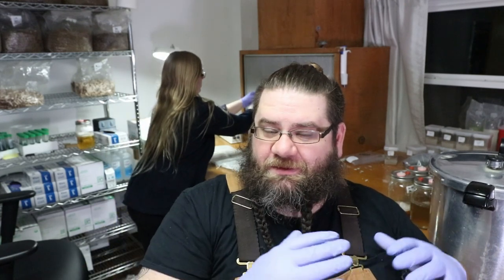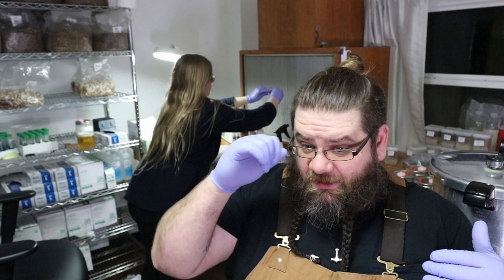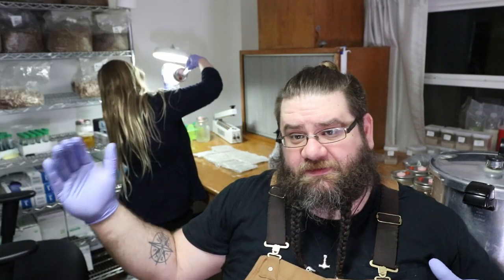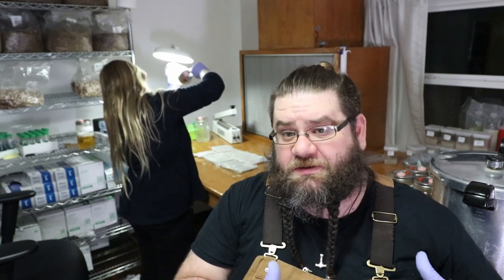That's really the big 3 differences. I mean, those are the big 3 sterilization methods open to most people at a smaller sized farm to moderate sized farm. Even with that big autoclave, unless I had a few of those units, you're talking $5,000 for the autoclave, $1,200 for the All-American, $100 for the Presto. Huge price differences, each one a big step up, each one being able to specialize in a job.